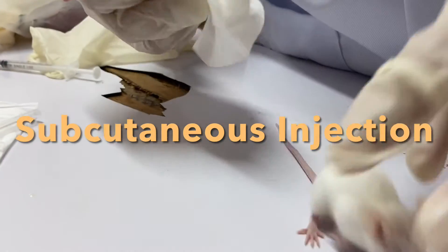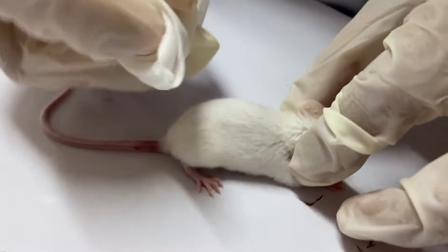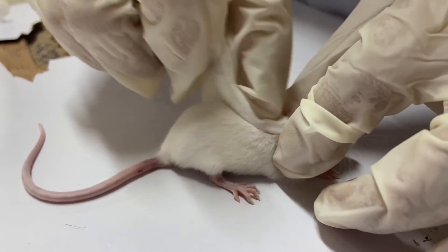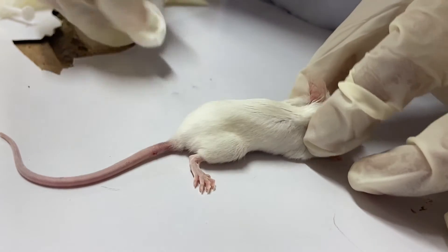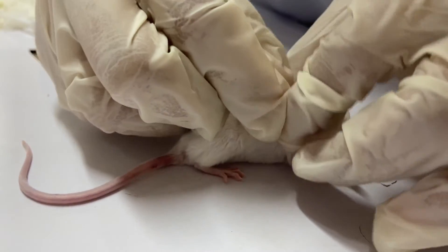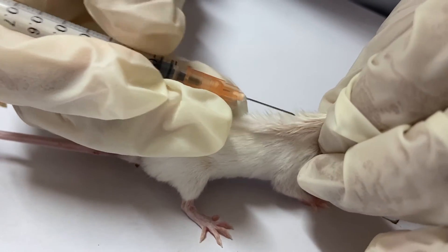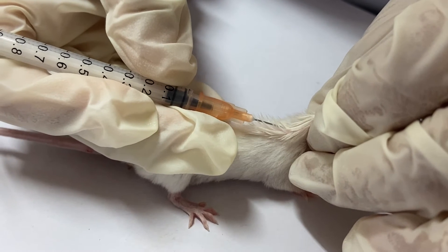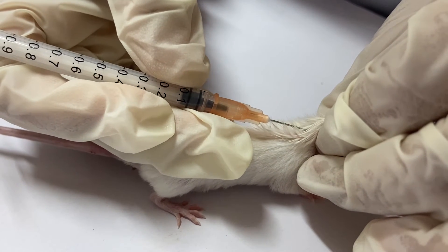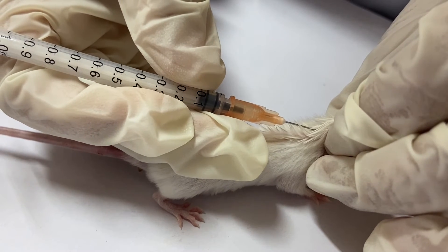Subcutaneous injection: handle the mouse firmly by the scruff using one hand. Swab the injection site with a sterile pad and alcohol. Lift the loose skin of the shoulder or back with your other hand. Insert the needle 5–10 mm through the fold of skin created by your thumb and index finger.